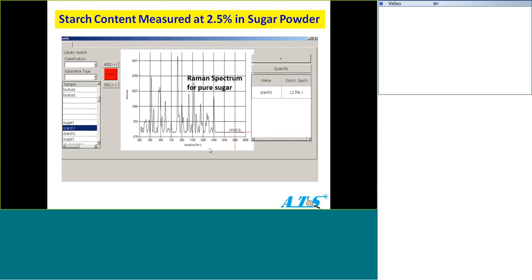If any issue comes up, or you have some questions, then we talk on the internet through TeamViewer. So you could see the screen like I see your screen, you see my screen, quite easily. Okay, so this is the data. We could do both identification and quantification, like I show you here, the steps in our software.